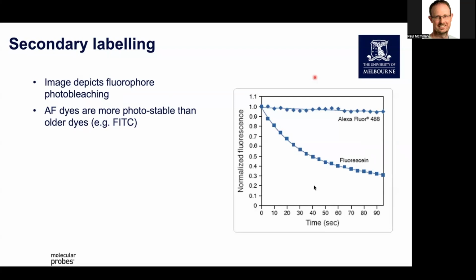Often we find people trying to transfer experiments that worked on flow cytometry into microscopy. One of the downsides is with flow cytometers, the sample flies past the laser very, very quickly, so you don't need to have high photostability, certainly not as much as you do in microscopy.